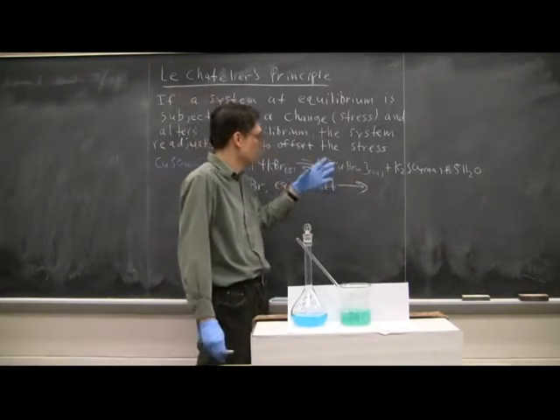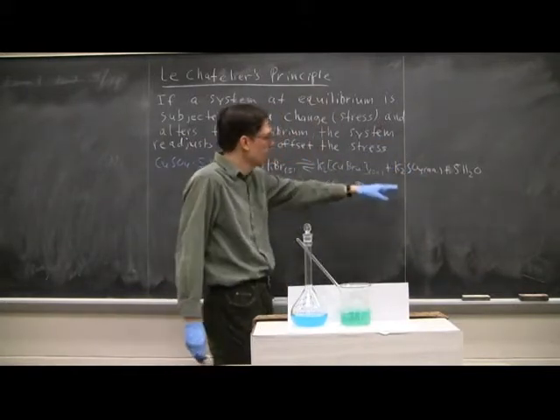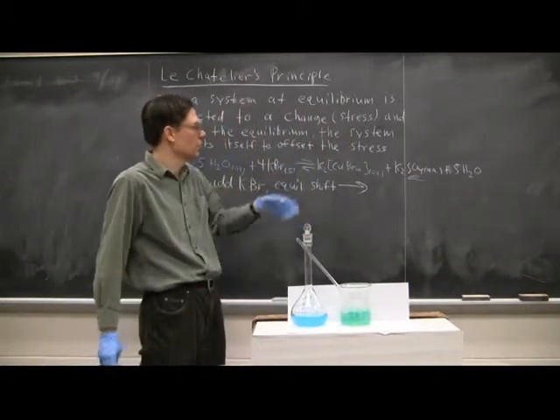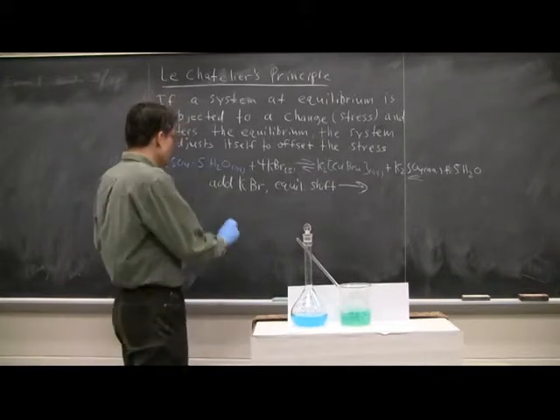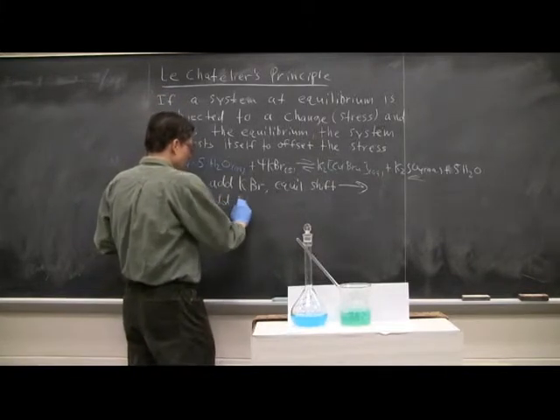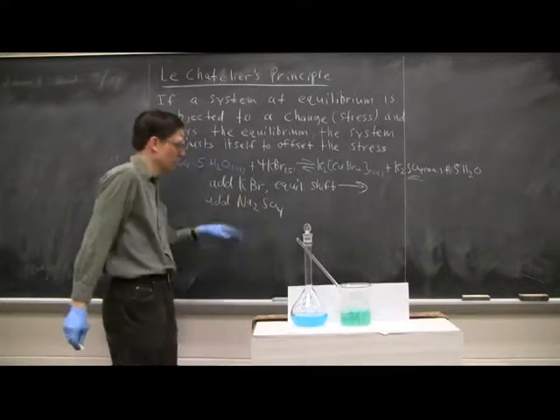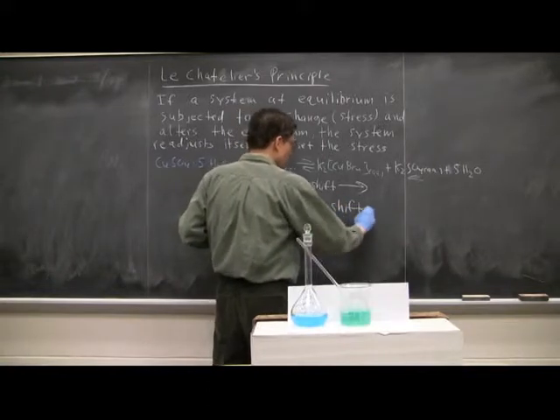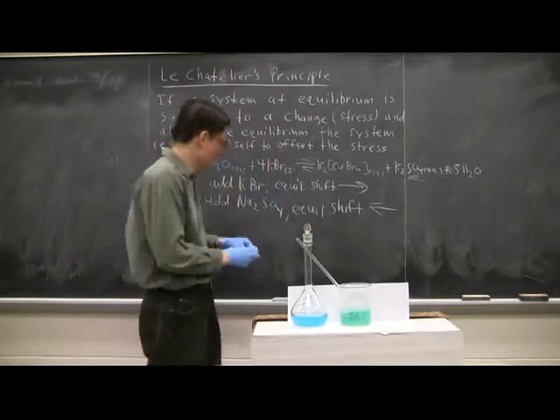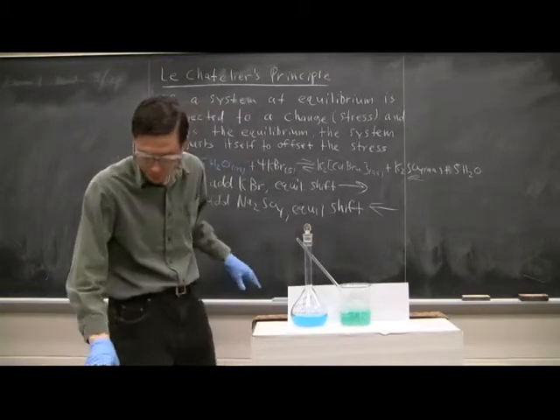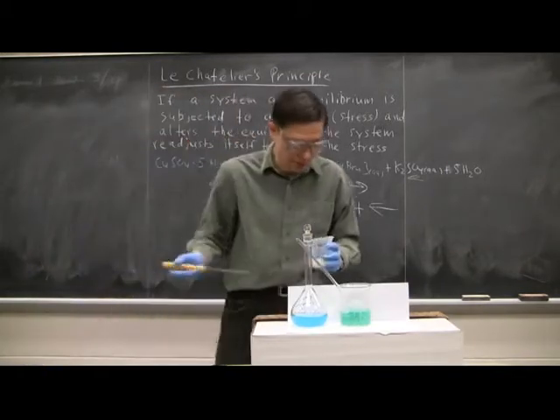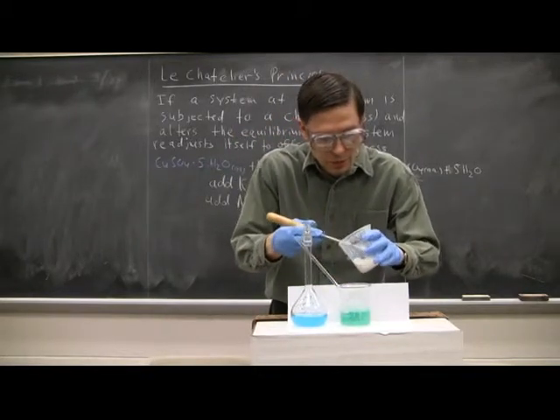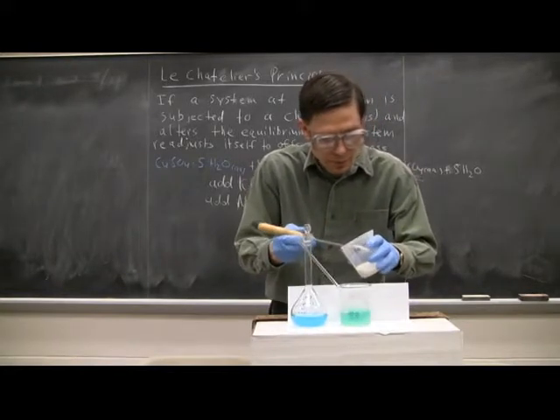Well, if we had some water, that's fine, but that's not going to do too much. But if we have something with a sulfate compound to it, like sodium sulfate or even potassium sulfate, it doesn't really matter. It's the sulfate ions that are important. So if we added some sodium sulfate, the equilibrium should shift back this direction. Let's see what happens. I have some sodium sulfate here in a beaker, so I'm going to put in a couple of scoops.